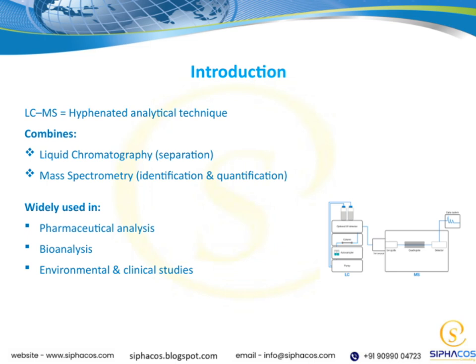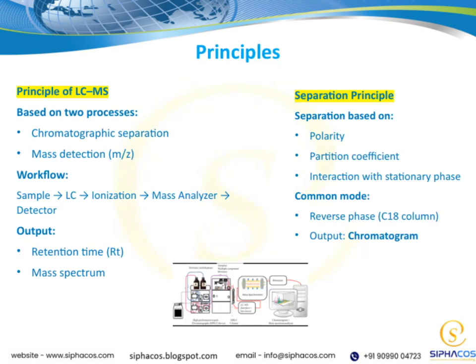Overall, LC-MS is a cornerstone technique because it combines separation and identification in one integrated process, enabling us to tackle complex analytical challenges efficiently.